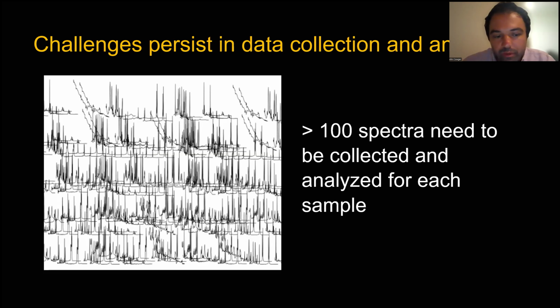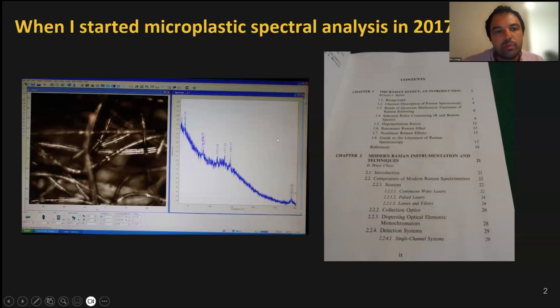More common, I'm going to be talking also about hyperspectral imaging, which will typically be in the hundreds of thousands of spectra. And this presents a real challenge because the traditional approach for analyzing these spectra is really one at a time manual exploration.